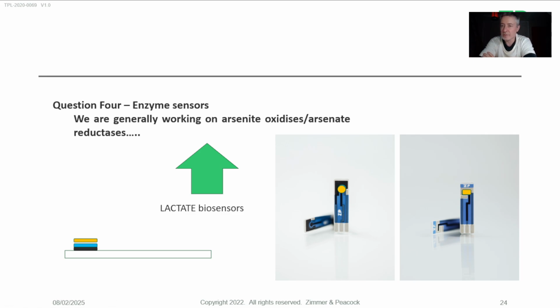But I like the 301 because it's got a silver chloride counter electrode, which is a very nebulous answer, but I feel like it often helps, especially with lower power potentiostats. So the 501 is great for the circular electrode and ease of pipetting. The 301, the rectangular one, is good, and I'll try to put some links underneath the video, because it's got this silver chloride counter electrode, which is really quite useful sometimes, especially with potentiostats that are a little bit lower power.